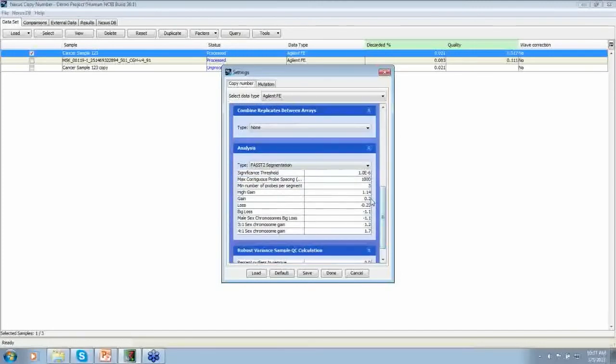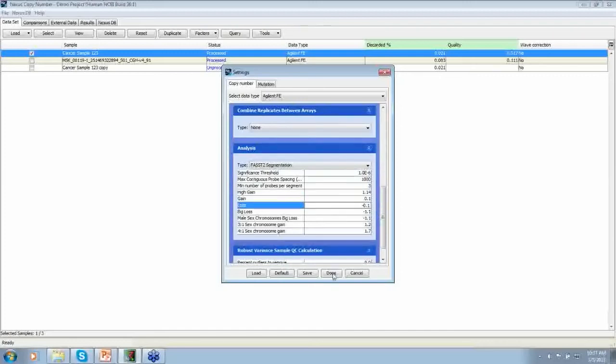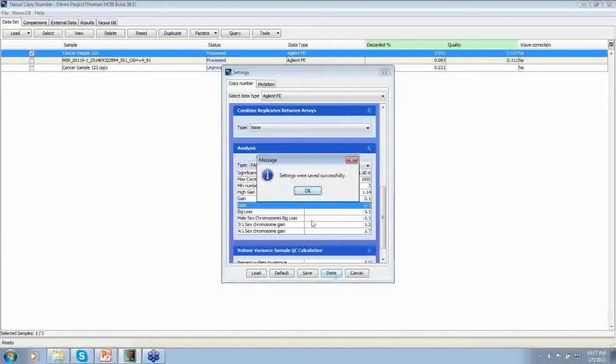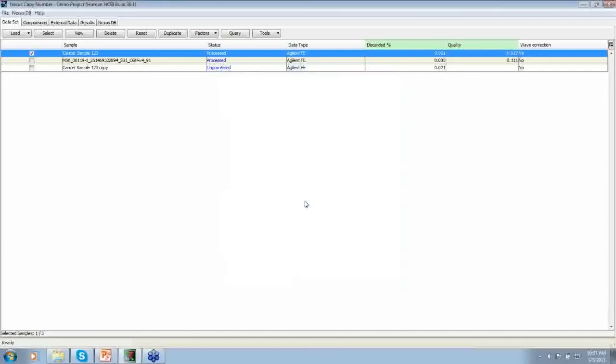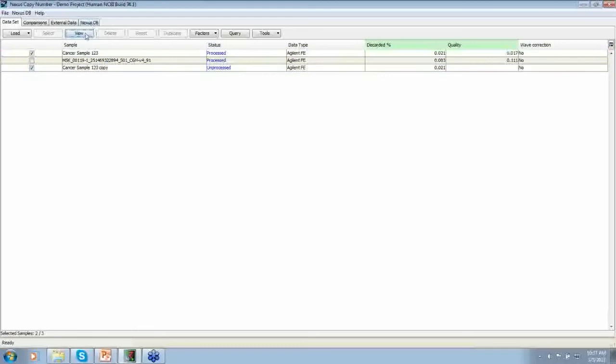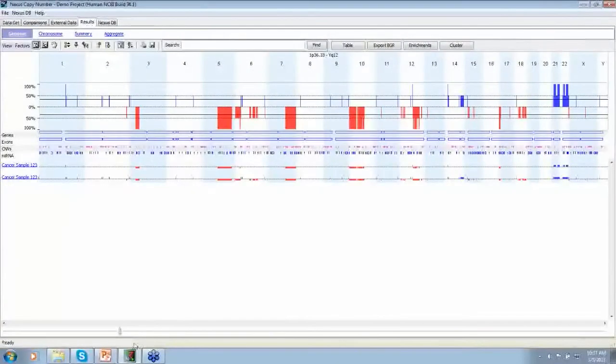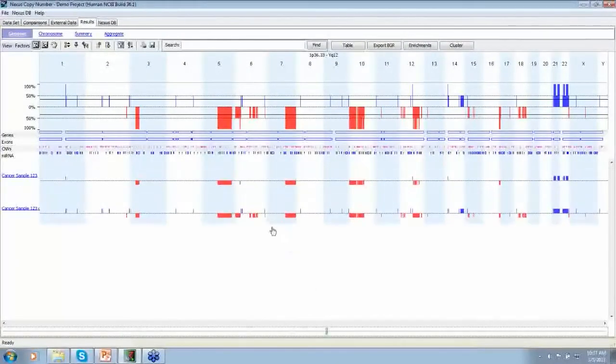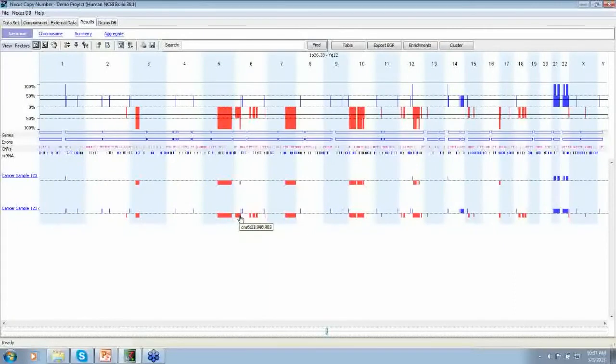Instead of 0.2 and minus 0.23, let's call it 0.1 and minus 0.1. So we're going to bring down the thresholds to detect even more low level mosaic events. So if I do that, you can see that we're making calls now on 6.